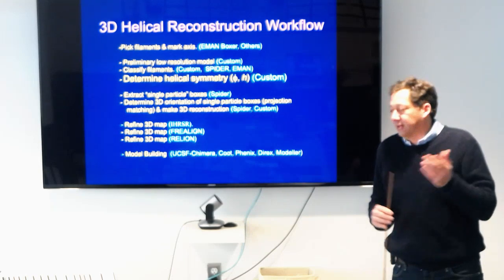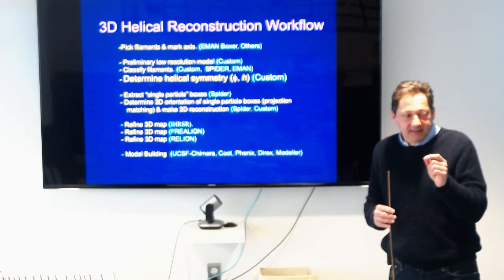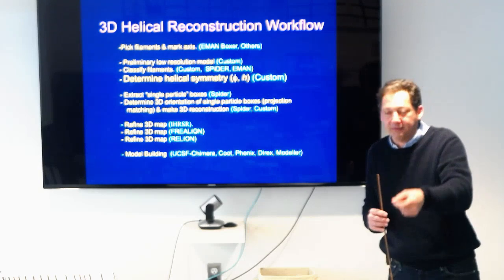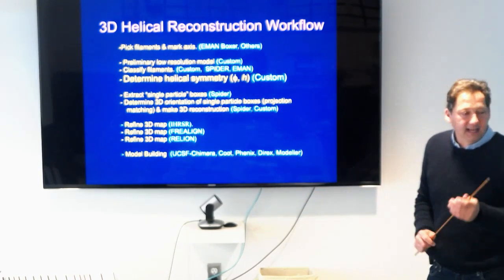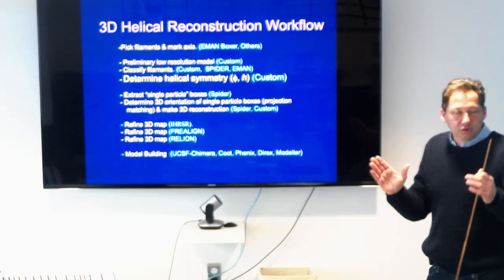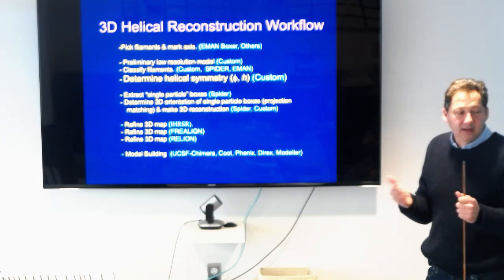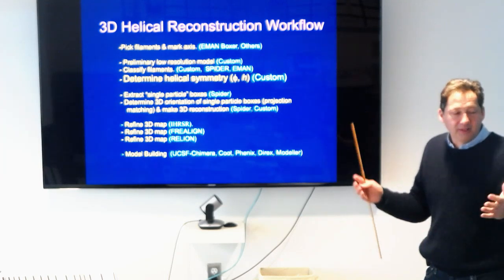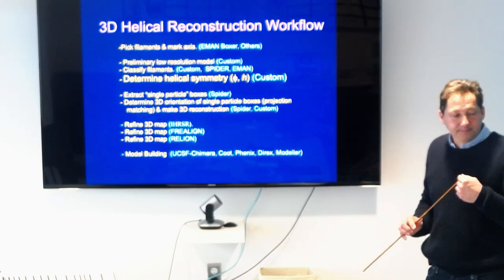And the other advantage is that we can run a lot of reconstructions, try different things, and check if that is giving us a better resolution or not. But anyway, that's the size. The pixel size that we are using now is about 1 angstrom per pixel, actually less, 0.8. So that means more than 600 by 600 pixel boxes, which is relatively big.